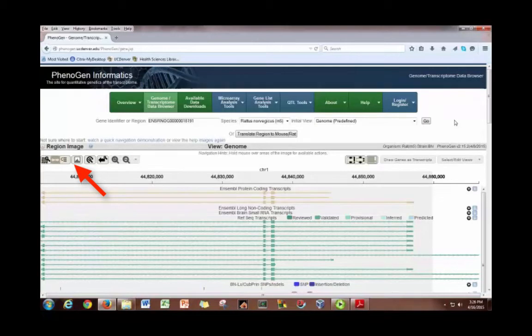This one will take a picture of whatever you're doing, and then zooming in, zooming out, and reversing to what you were before. Spencer is our computer programmer on this website, and he's done a fabulous job. If you hover over anything, you can see when I hovered over this one, it instantly told me what it did. So look for the clues if the picture isn't obvious.